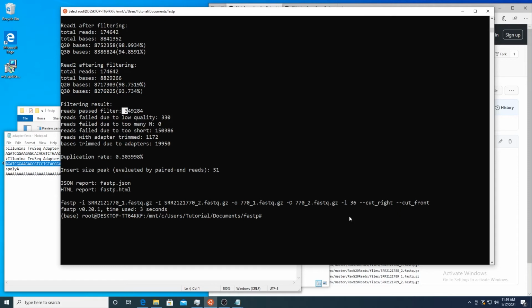This requires a few things though. For base correction, there needs to be a fairly high overlap between the two different reads, and it has to be paired end. And then there's a limit, a max amount of disagreed bases that are allowed between the two reads. By default, that's 5 base pairs between the two reads for not matching. And then 20% is also another flag that you have to see. So if we want to do this, the base correction, you can use -c for that. We go ahead and run this.